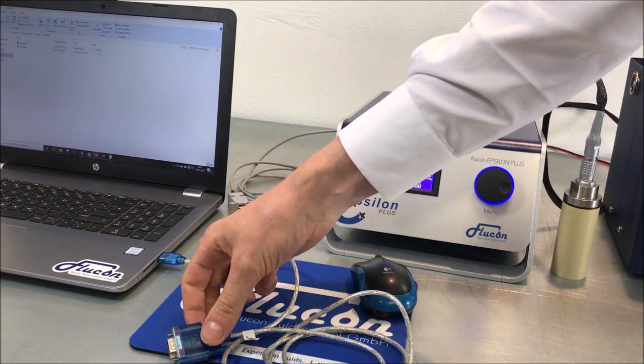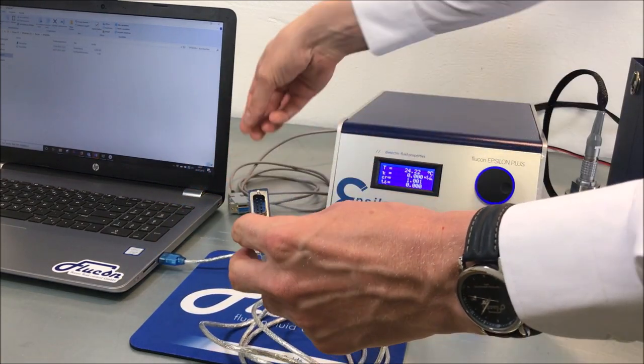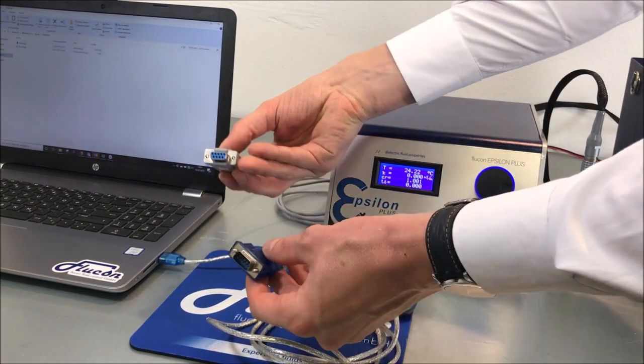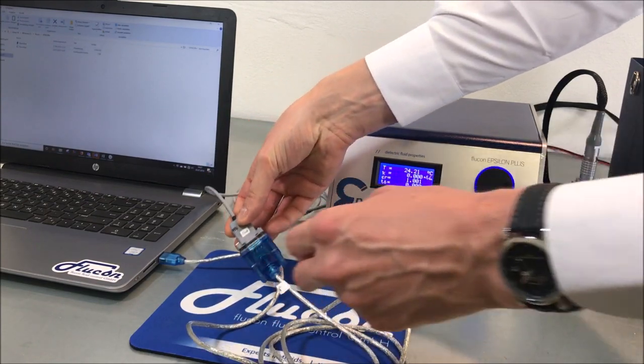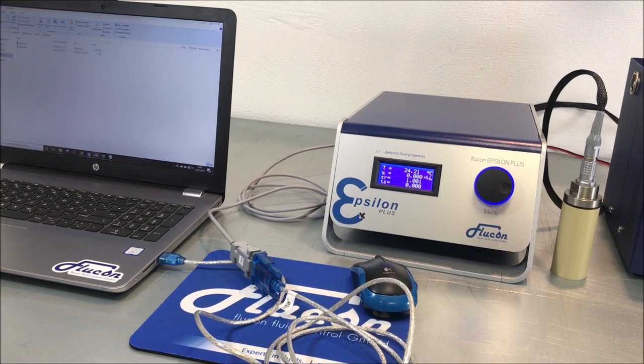You can check this by means of the device manager on your computer. Next, you connect the USB adapter to your PC cable. Now your Epsilon Plus Dielectricity Meter is connected to your computer and you are ready to prepare for measurement.